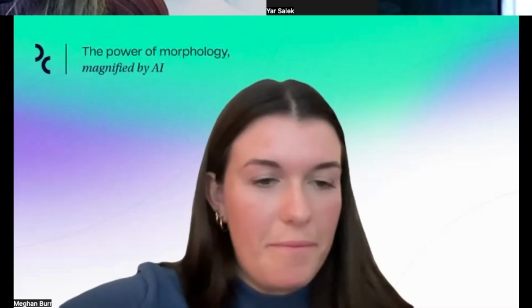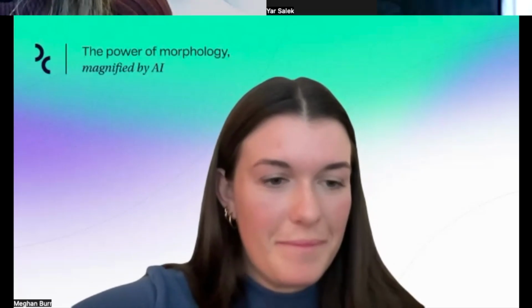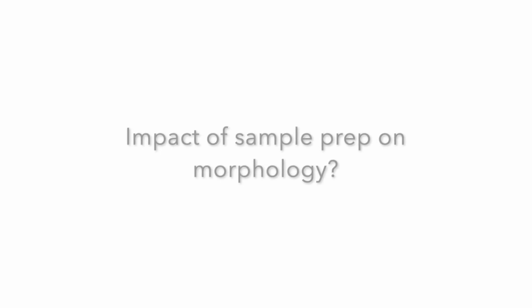Thank you. Awesome. And Caroline, did you have anything to add? Yeah, and I can just add that for our analysis, we were using viably cryopreserved cell samples, and as Megan already mentioned, it's important to be consistent.